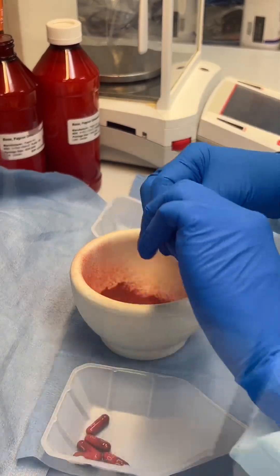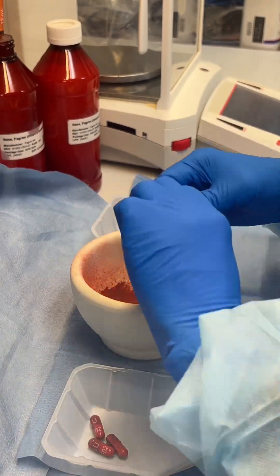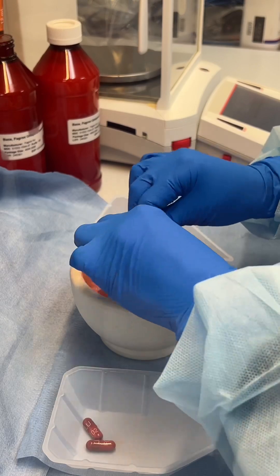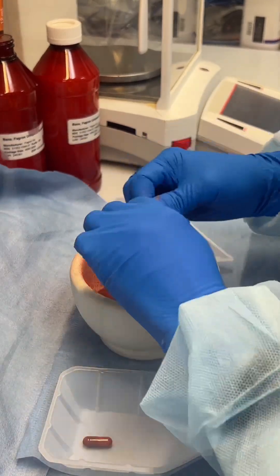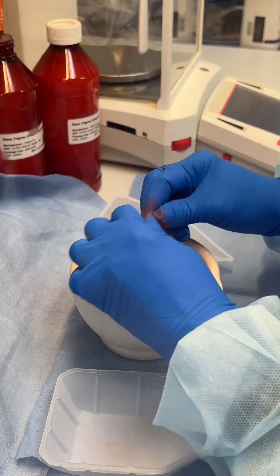After calculating the number of capsules needed to create our suspension, we carefully open each capsule and transfer the powder into a mortar. These capsules in particular are a little bit hard to open, so they require a little bit of extra time.